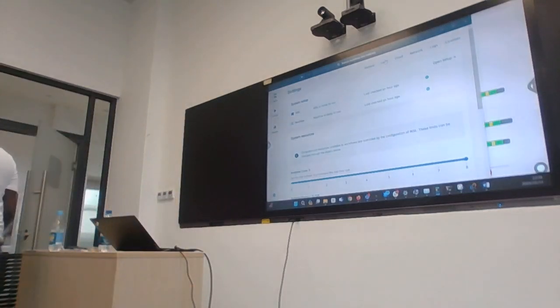Let's see what happens. Okay. I'll install Docker here while you go. Are you going to Epi2Me or are you? Okay. Let me install Docker first. But I can get you... I've got the right app on my phone, but they're not going to let me. Okay, just give me a minute to do this.